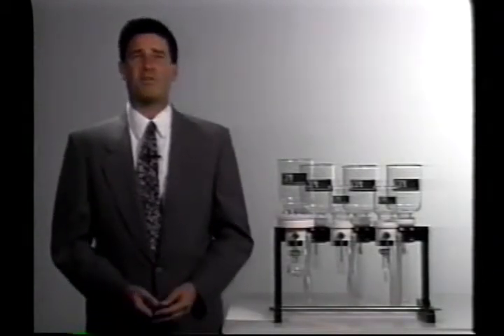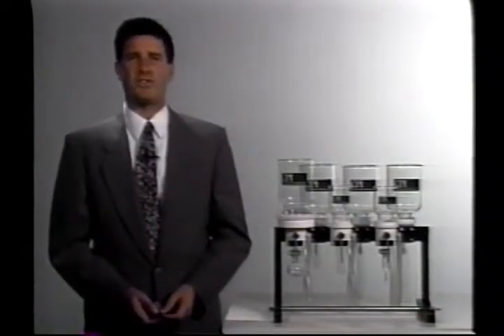The MultiPrep 7000 is CPI's second generation of extraction manifold. We've learned a lot over the past several years by surveying many of the laboratories using our earlier version of manifold, by also speaking with laboratories using alternate and competitors' manifolds, as well as doing internal testing, and we've come up with what we feel is the best and most versatile manifold on the market today.